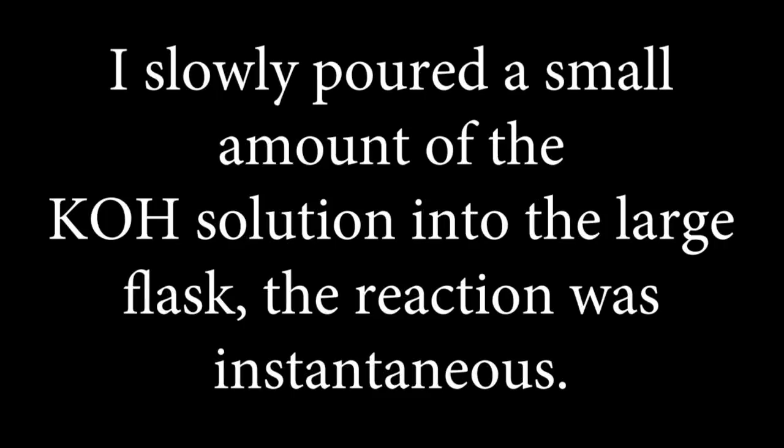I slowly poured a small amount of the potassium hydroxide solution into the large flask. The reaction was instantaneous.